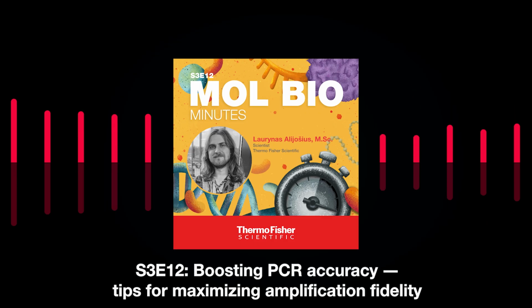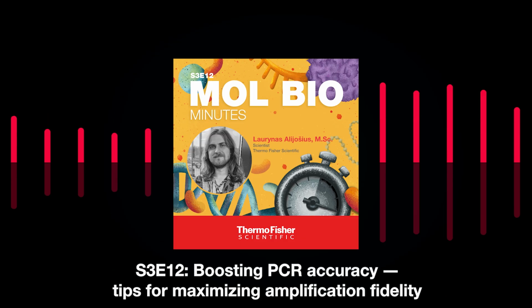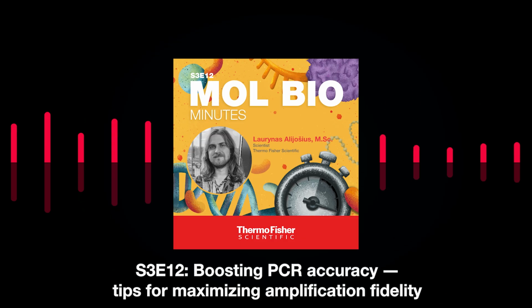If you want to learn more about these proper cycling conditions, you can find a link in the notes to a page that outlines PCR cycling tips to help you optimize it.